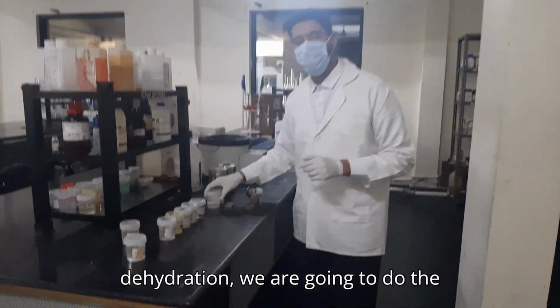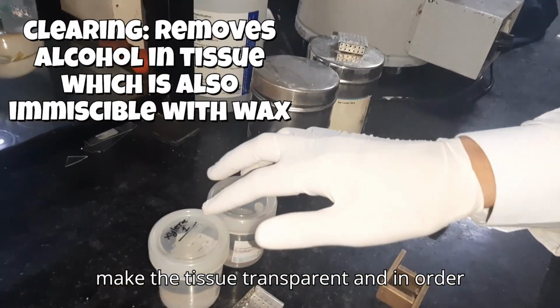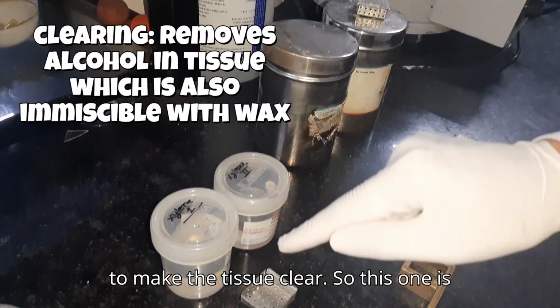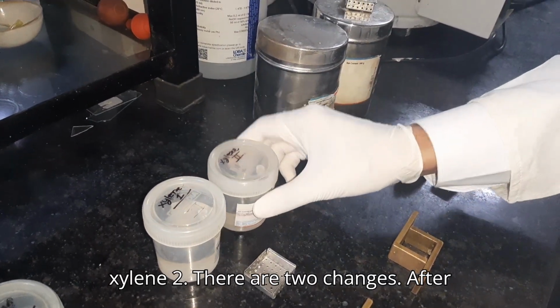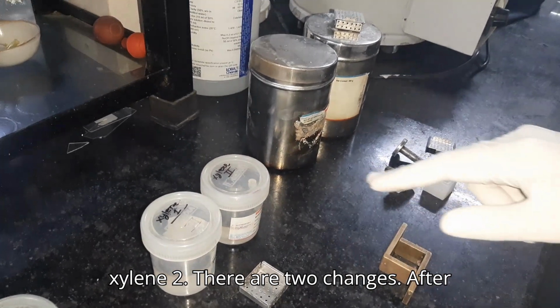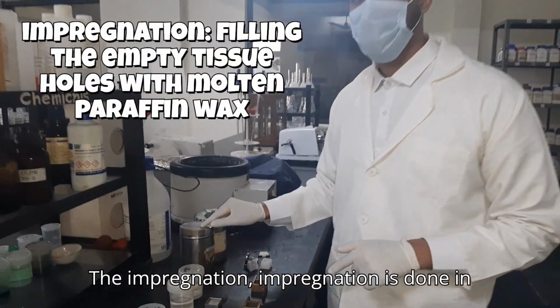After the dehydration, we are going to do the clearing. Clearing is done in order to make the tissue transparent and clear. This uses xylene number 1 and xylene number 2. There are two changes. After this is done, we are going to do the impregnation.